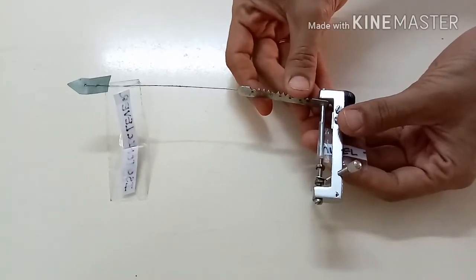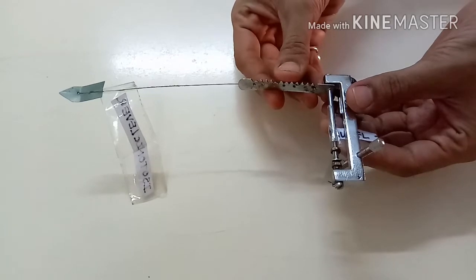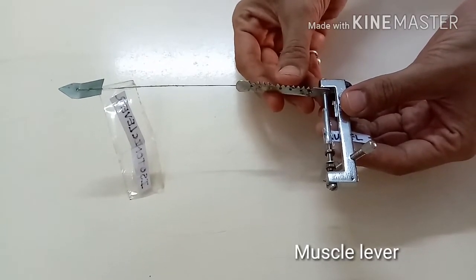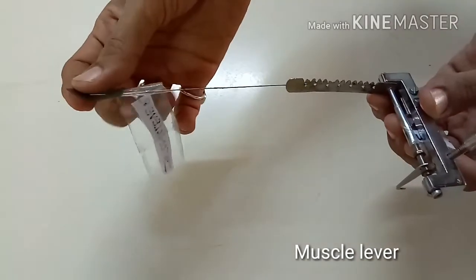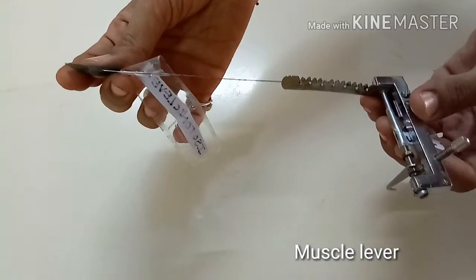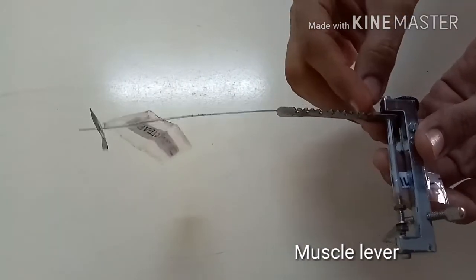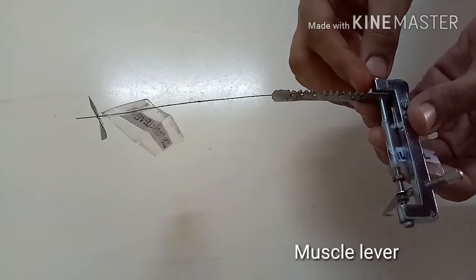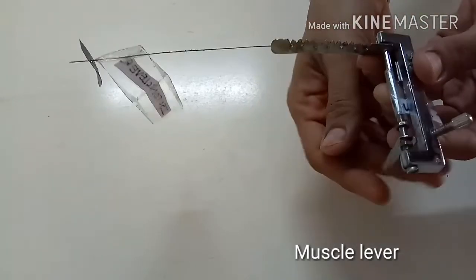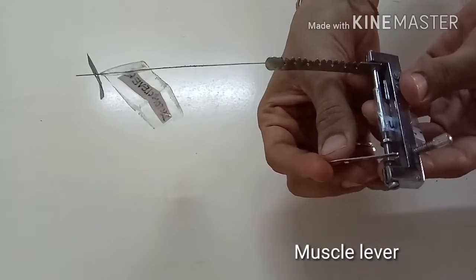Now we will discuss about Writing Levers. First we will discuss about Muscle Levers. It is an L-shaped lever which is used for magnifying and recording muscle contraction. It has one horizontal arm which bears a writing point. This is made up of a triangular piece of photographic film. At its end, and on the other end there are few holes on which weight can be hung near the fulcrum. On the vertical arm there is a hook to which the tendon of the muscle is tied via thread.